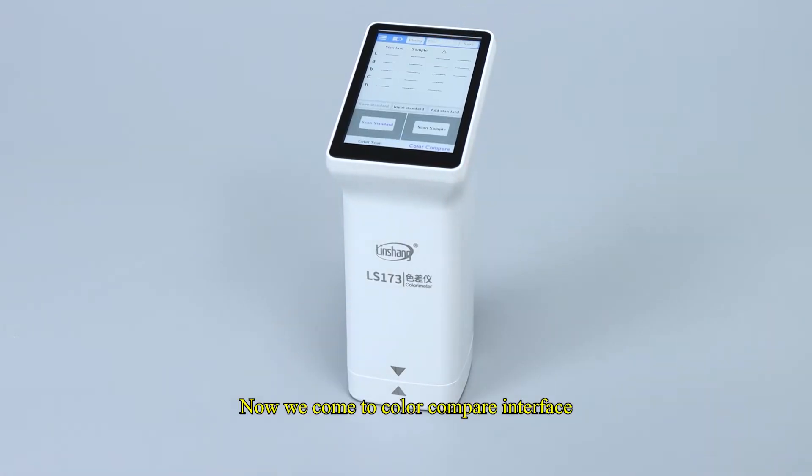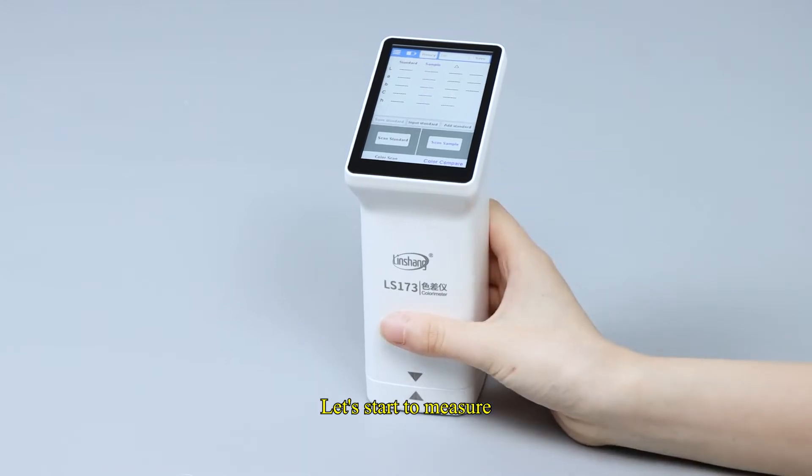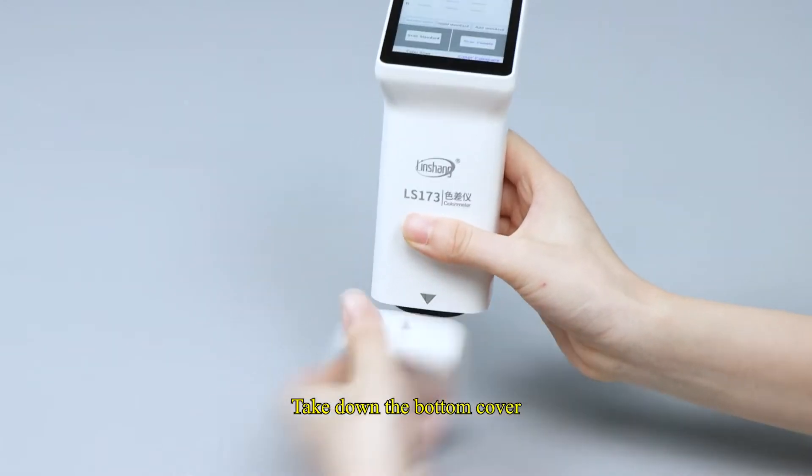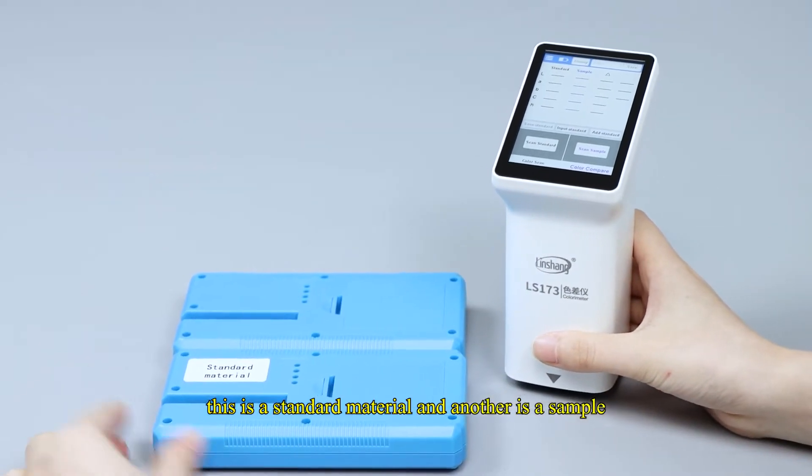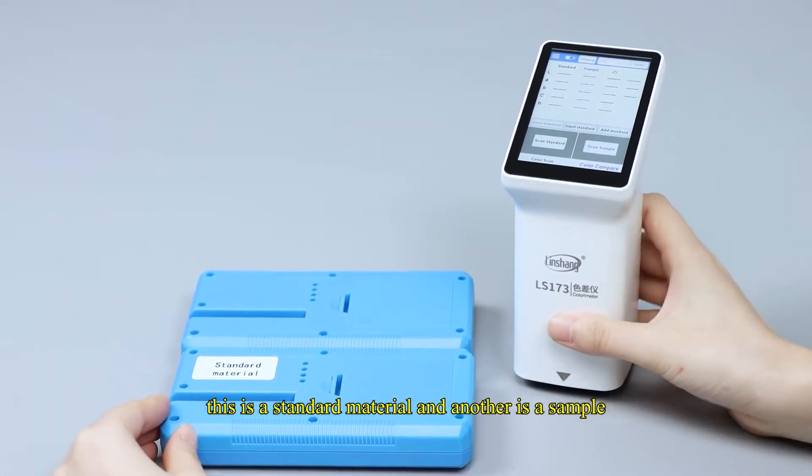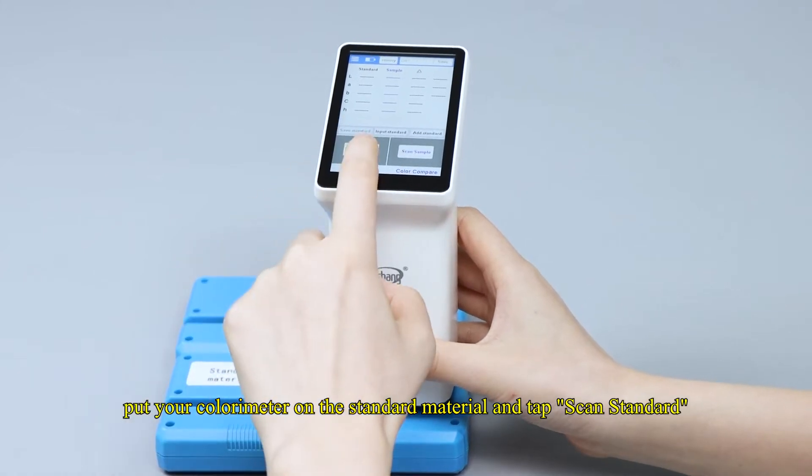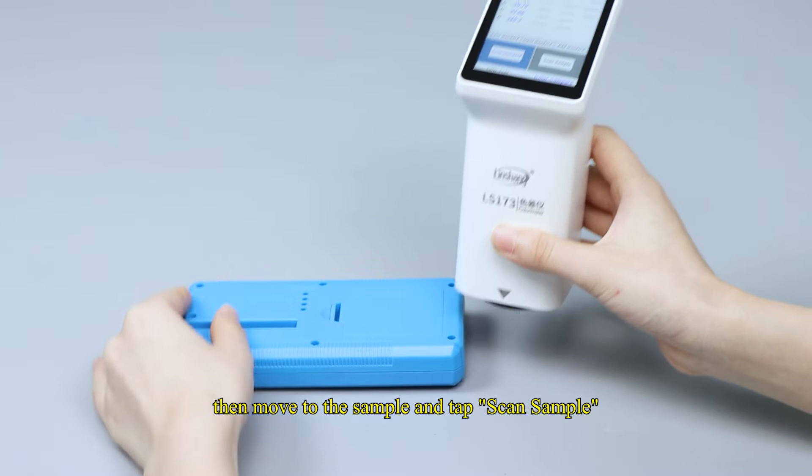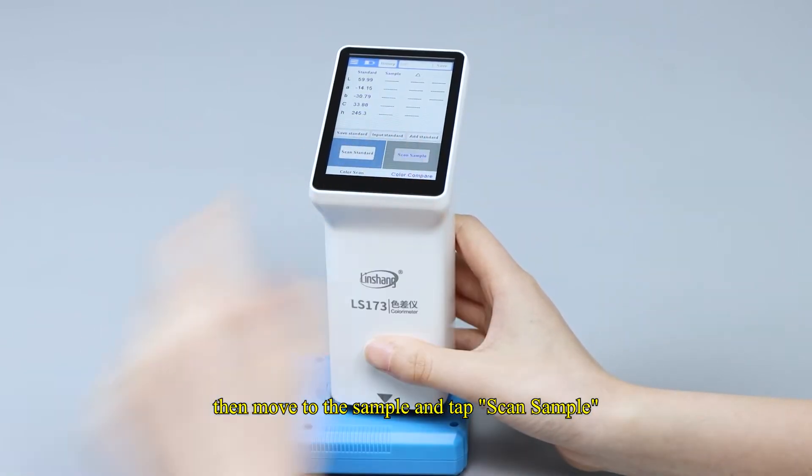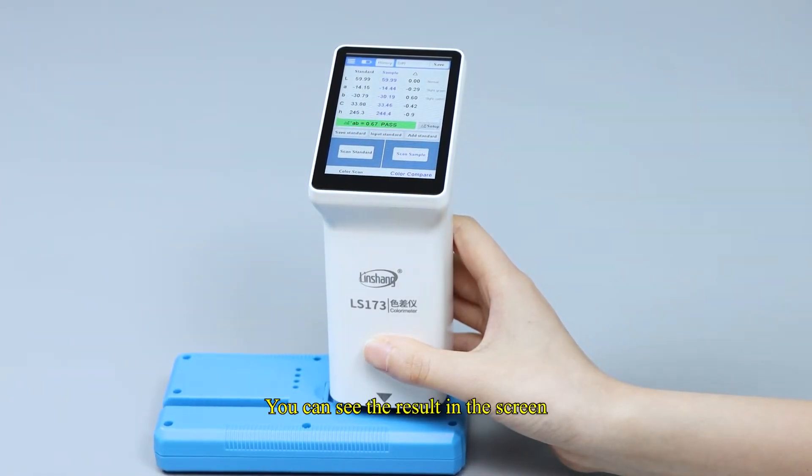Now we come to color compare interface. Let's start to measure. Take down the bottom cover. These are two plastic shells. This is a standard material and another is a sample. Put your colorimeter on the standard material and tap scan standard. Then move to the sample and tap scan sample. You can see the result in the screen.